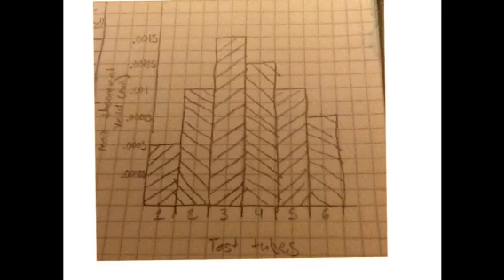For number 4, it says, which tube had little to no reaction of the supernatant with either PbNO3 or NaI, and what is the mole ratio for this reactant in this tube? So you can see that number 3 is where this should be, because theoretically we should have no excess of anything in the supernatant. It should just be spectator ions, but due to human error, we messed up something by a minute amount, so we got a reaction in the supernatant test.